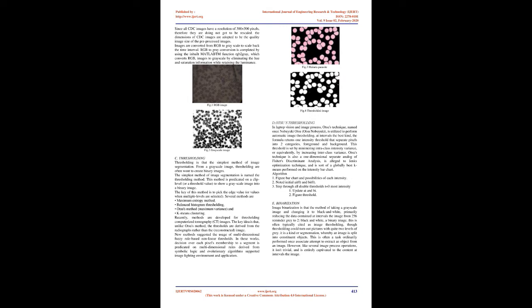All images are rescaled to have the same size using the inbuilt MATLAB function imresize. Since all CDC images have a resolution of 300 × 300 pixels, they do not need to be rescaled. The dimensions of CDC images are adopted to be the standard image size of the pre-processed images.